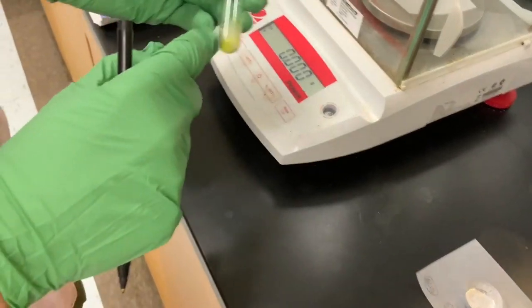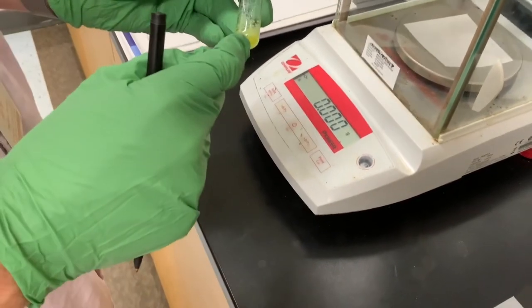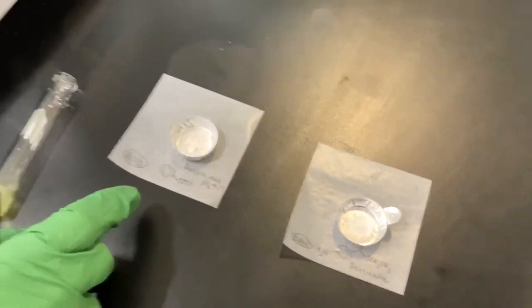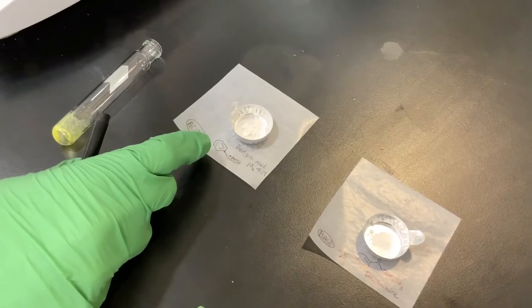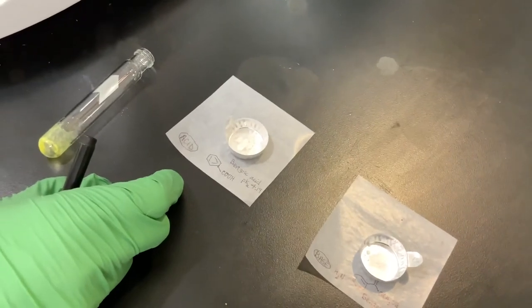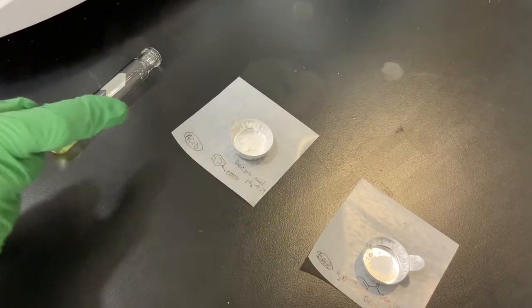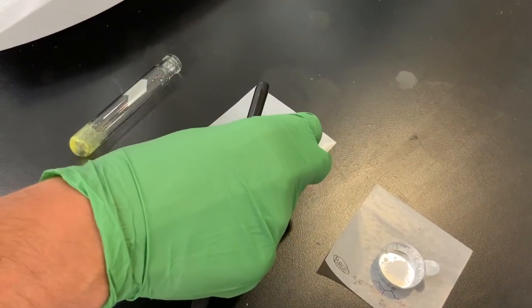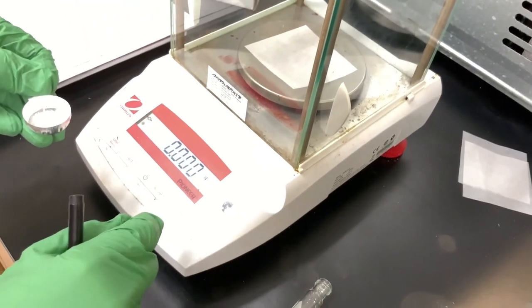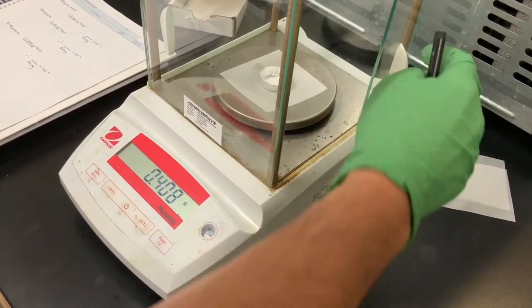Okay, so we've got our culture tube. All of the methylene chloride has evaporated off, so we just have our 9-fluorenone in there. Of course, we've got our benzoic acid and benzocaine as well. We went ahead and already scraped out the two solids from their respective Hirsch funnels, and we know the tare weights of each of these. So we're going to weigh all of them, acquire their masses, and subtract the tare weights to determine how well we did in terms of separating these three organic solids from the original methylene chloride solution of it.